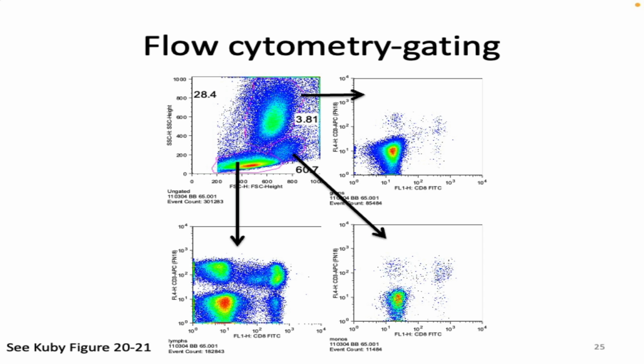And I could then say, oh my gosh, I only really like these lymphocytes. Let me double click on that and examine them with further stuff. If I have a machine that does 16 colors, I can super finely distinguish all of these things. And I could look at these guys and then these guys and then these guys. I could do days of analysis of looking at different types of cells.